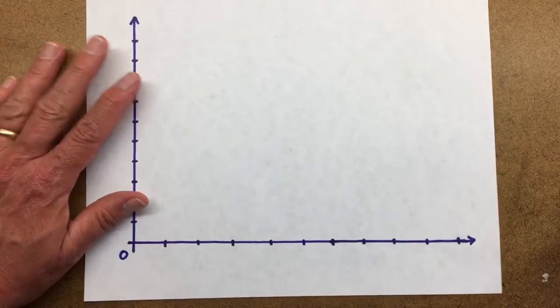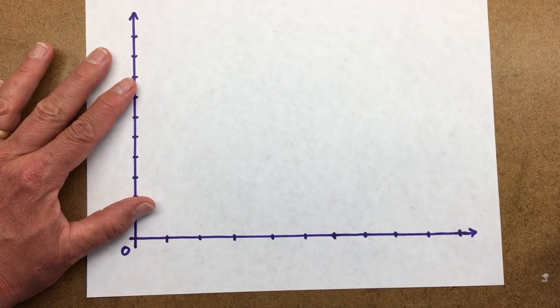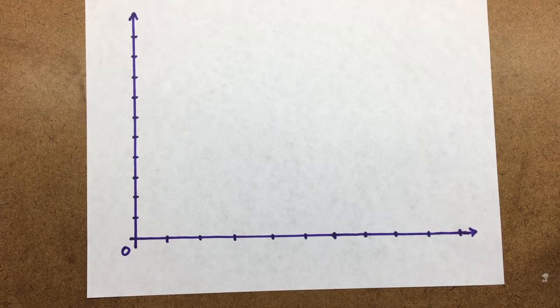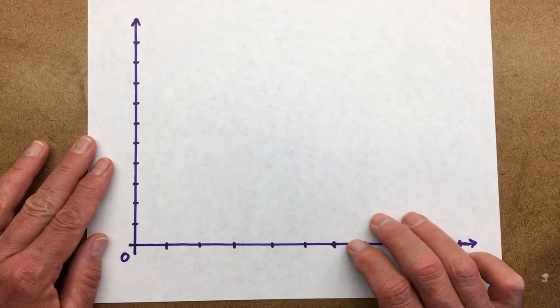Okay, now you're going to need to prepare some graphs as well. You'll need to make 3 graphs. One is going to be the standard curve. So when you go to make the graph, you probably don't have graph paper at home. This isn't a piece of graph paper.